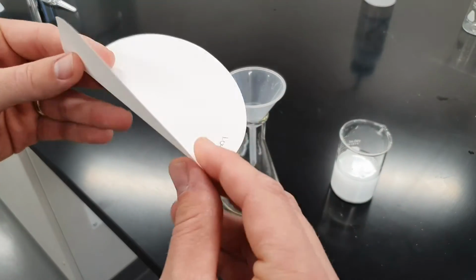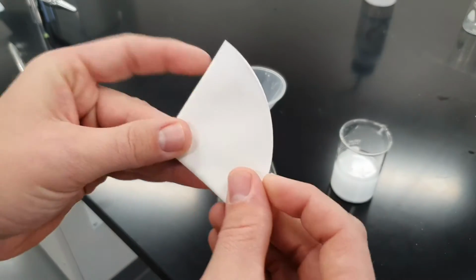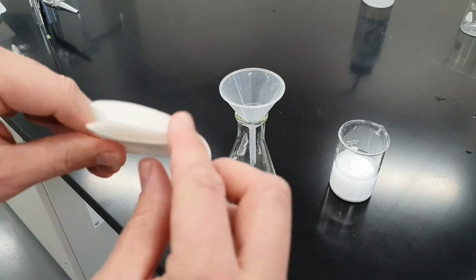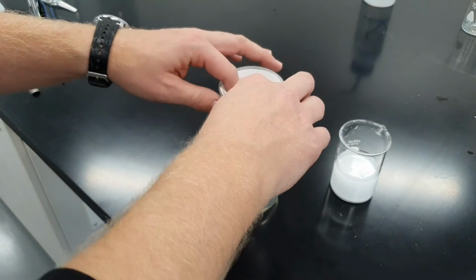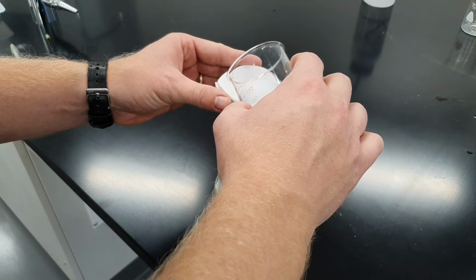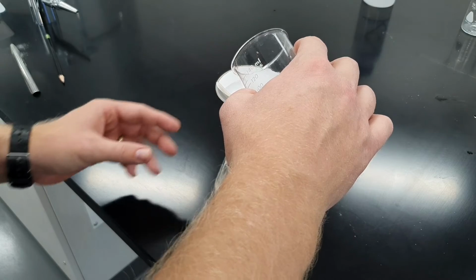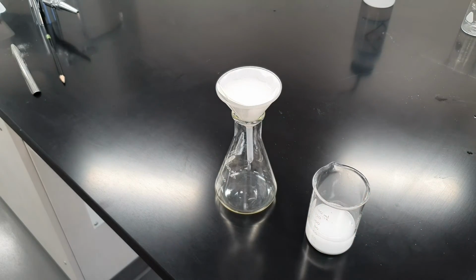So when we're doing this, we want to fold the filter paper in half once. We want to fold it in half again, and then open back up, and there's our nice little funnel to go ahead and filter our solution. So we're going to pour this through, and we'll see what happens here. You don't want to over pour the filter, but we'll just let it sit there and filter for a second.